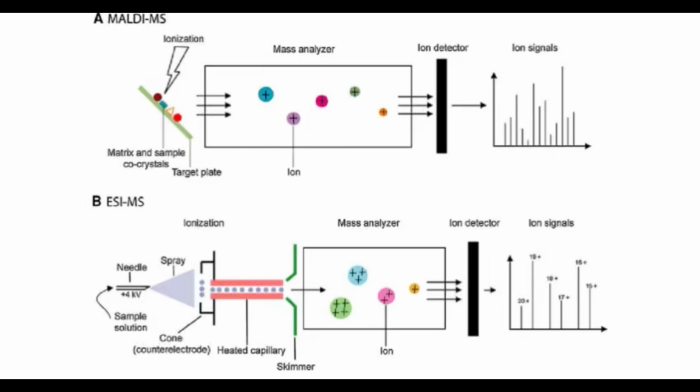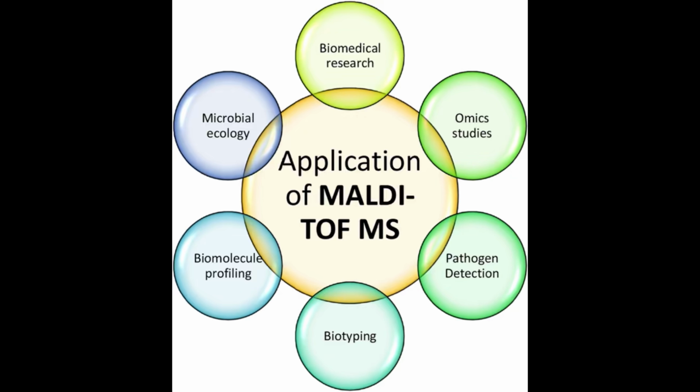The key difference between MALDI and LCMS is that MALDI typically doesn't involve chromatographic separation. You're analyzing a sample directly from the target plate. This makes it faster for some applications, particularly when you're interested in molecular weight determination or protein identification using mass fingerprinting. However, MALDI isn't typically used for small molecule quantitation in complex matrices the way LCMS is. MALDI excels at biopolymer analysis, while LCMS dominates in quantitative pharmaceutical, clinical, and environmental applications.